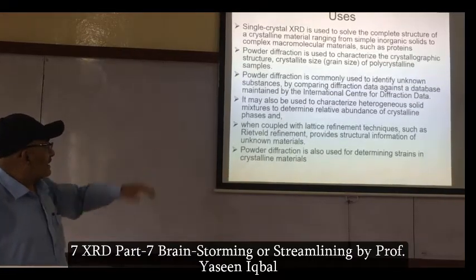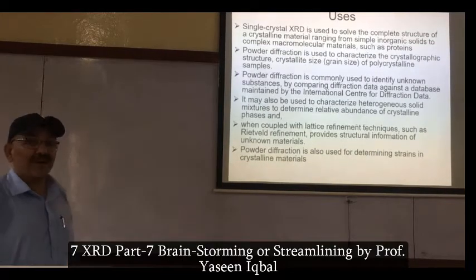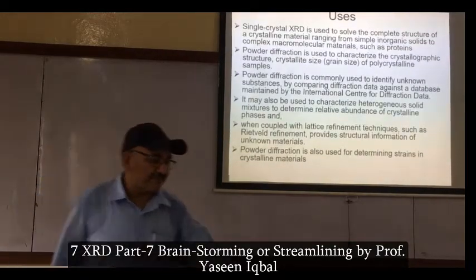We also use it to characterize a heterogeneous solid mixture to determine the relative abundance of crystalline phases.